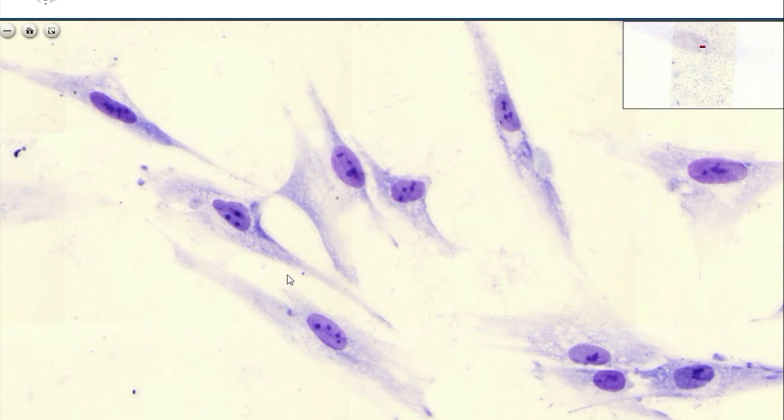Please note that in this case, the entire cell is visible in the slide, because this is not a cut slide — it's not cut with a microtome. The cell culture dried onto the glass plate, so you will see all the processes. In our next slide, in a true tissue from a human, you will see many times cross cuts.